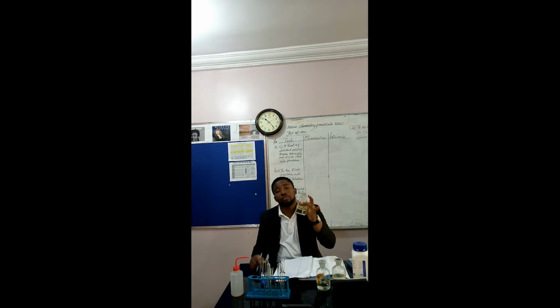But before I start, I would like to show you the reagents for today's salt tests. In this container is sample C, so we are going to carry tests on sample C. Now in this container is barium chloride solution, my dilute hydrochloric acid and sodium hydroxide solution.